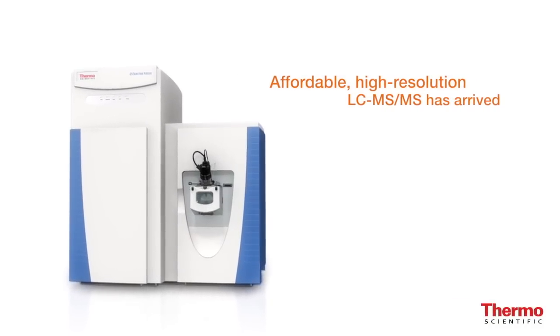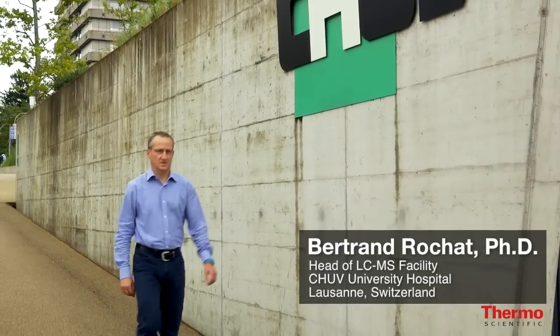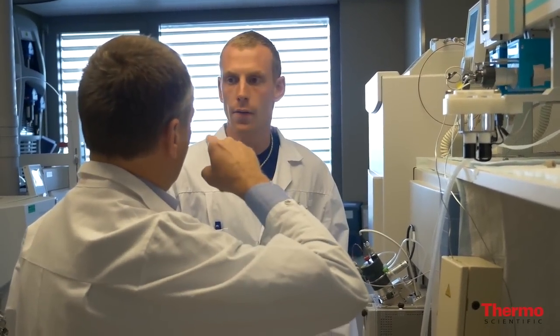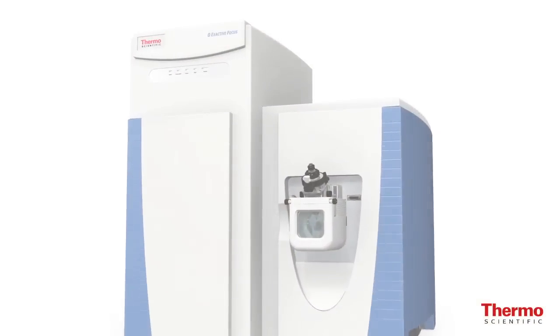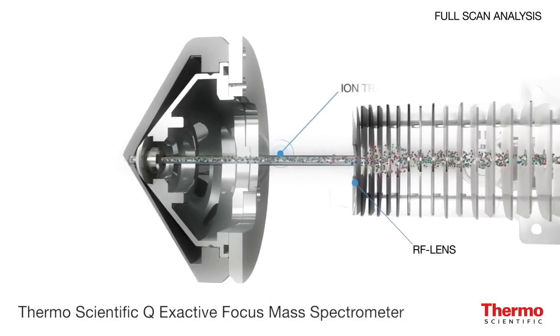My name is Bertrand Rochat. I work in the University Hospital of Lausanne in Switzerland. I'm a lab head in charge of a research facility in this hospital, and over the last 10-15 years I have performed LC-MS analysis, routine and research. For the last 2 years we have been performing analysis with these Exactive instruments.